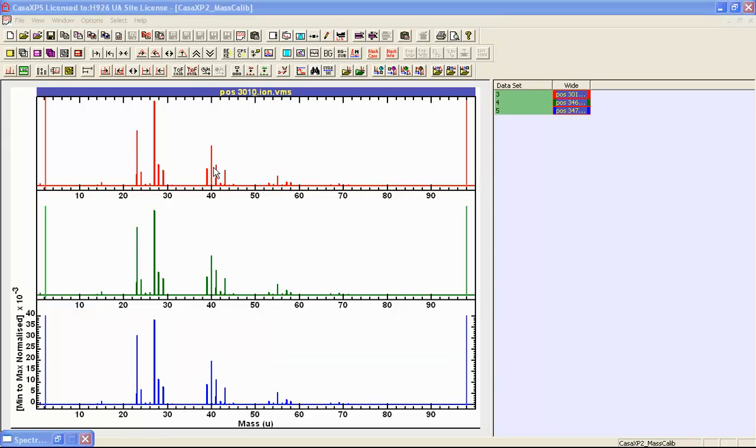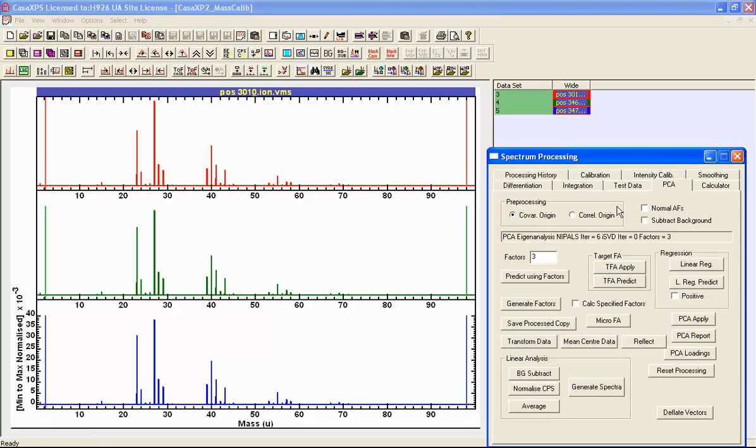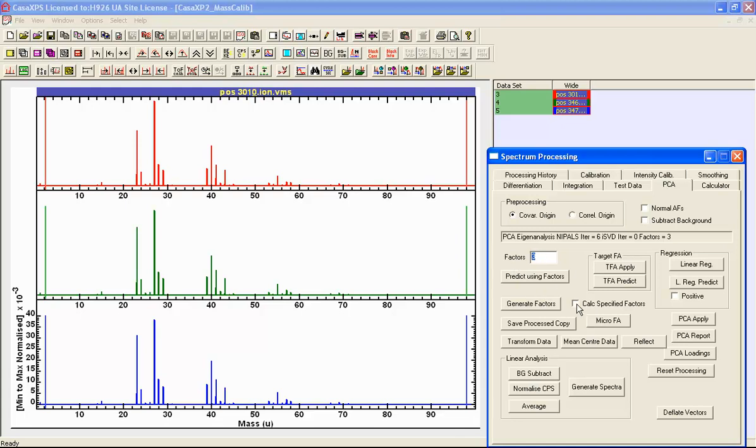To transform these spectra into abstract factors we need to use the principal component analysis property page, or the PCA page. We're going to use the number of factors to specify how many abstract factors we want to calculate, and then another button that is important is to tick the button that says calculate specified factors. When we have a large data set, we don't want to have to spend the time to calculate all of the abstract factors when the ones that will be interesting to us may just be the first half dozen. In this case we just got three, so we can only calculate three.